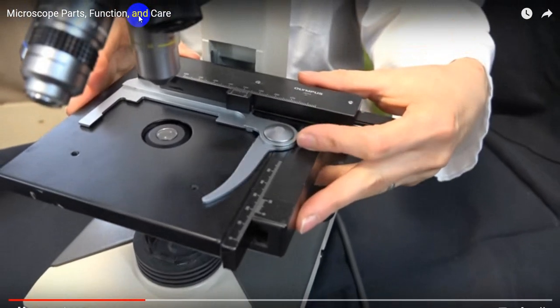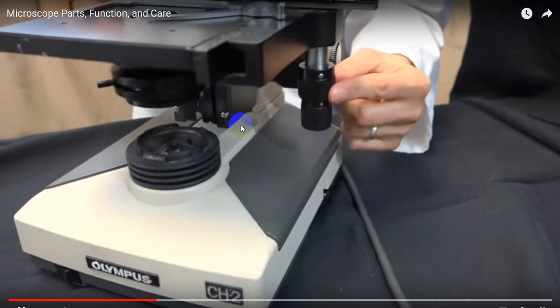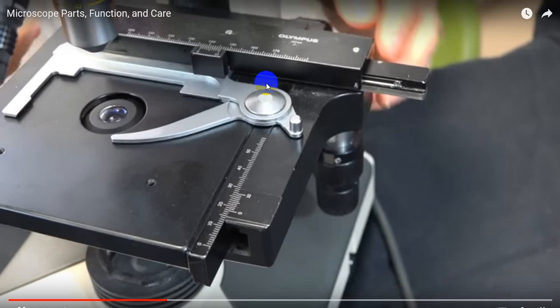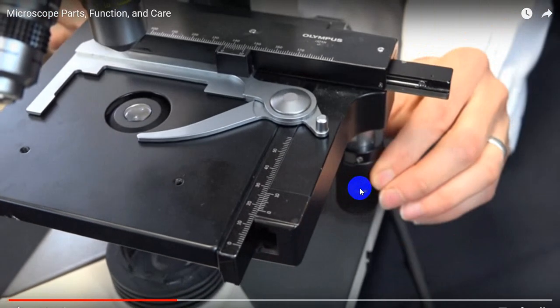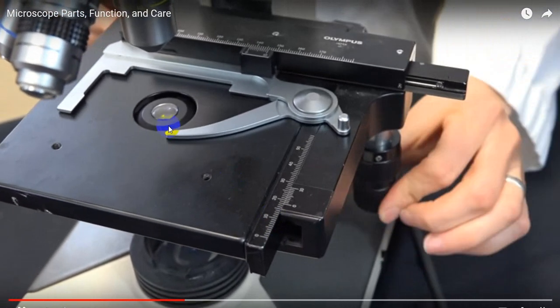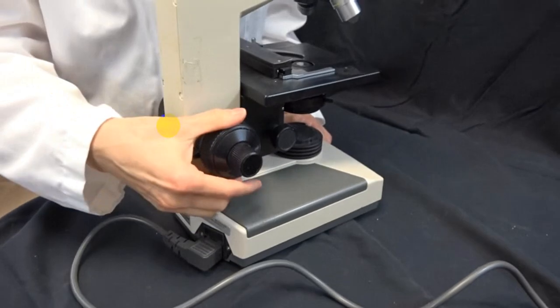On the stage there is a clamp. This is the mechanical stage, which has a clip to hold the slide. On one side of the stage there are the stage moving controls. One control moves the stage back and forth. The lower control moves the stage right and left. These dials move the stage up and down to help focus your specimen.